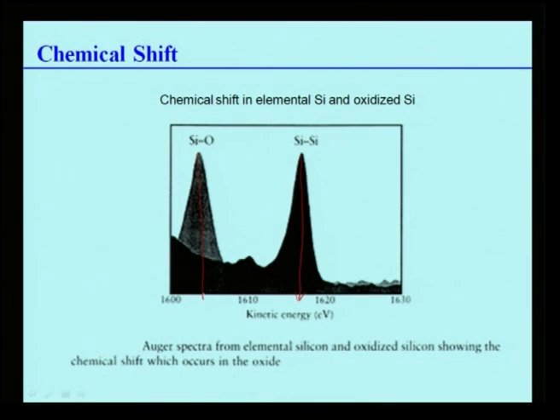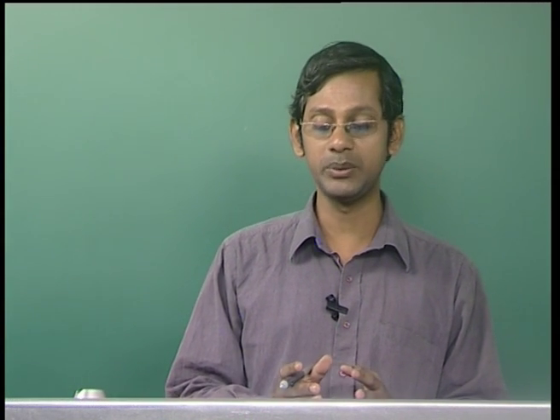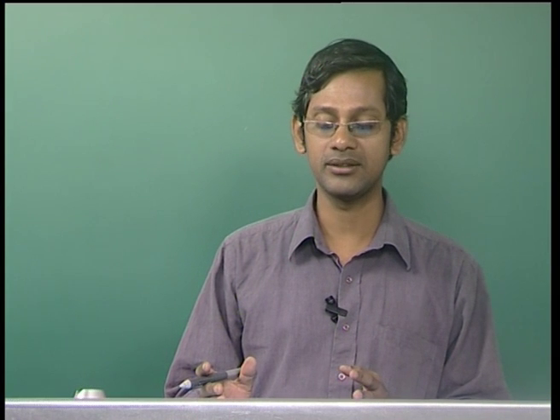two very clearly. And it is even much clearer in AES than in XPS that these kinds of chemical shifts are actually observed and can be used to differentiate between the different kinds of bondings. Bonding in the sense of whether it is a bond between similar atoms or dissimilar atoms, oxides, nitrides, all can be detected there.